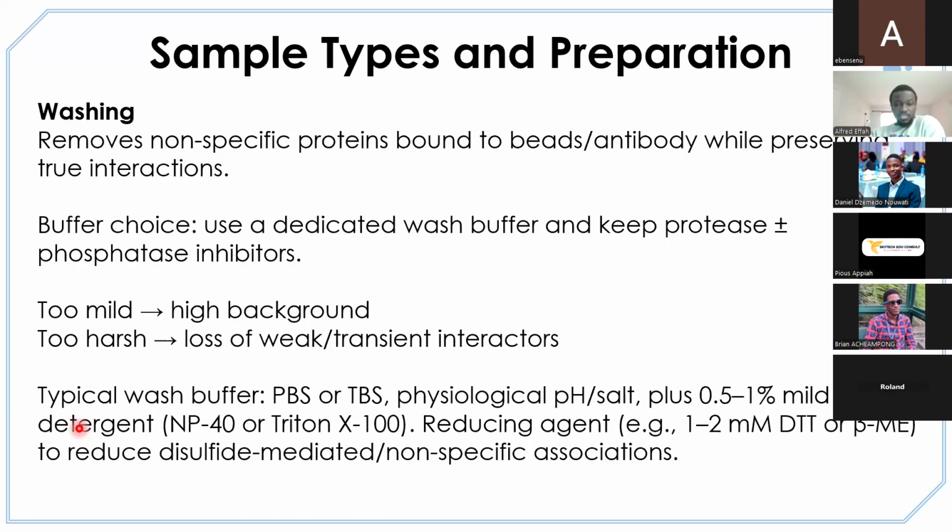So washing too is very important. You know, whenever there is an antigen-antibody reaction, we also suspect some sort of background noise, and you might want to reduce this background noise that is coming in, which will interfere with your results or your findings. And so washing is very important. You make sure to include protease inhibitors or phosphatase inhibitors, so that the interaction is also maintained, which is very important.